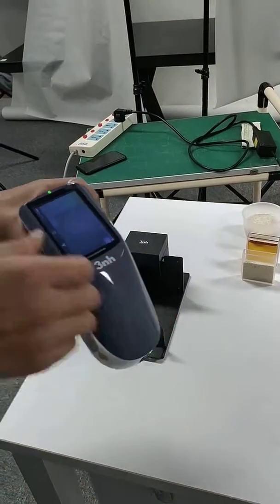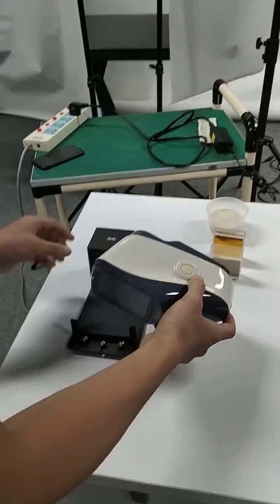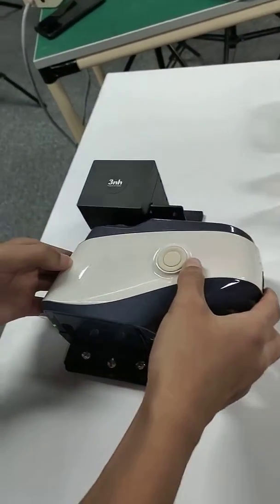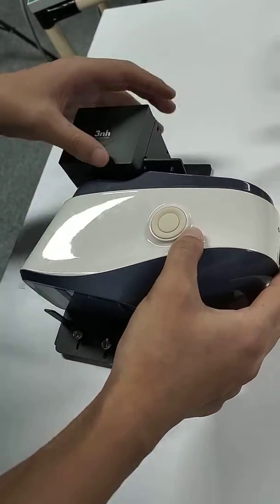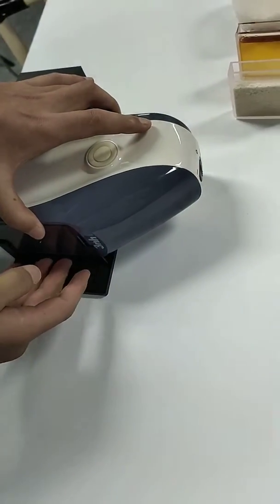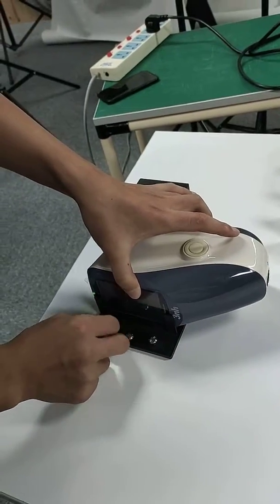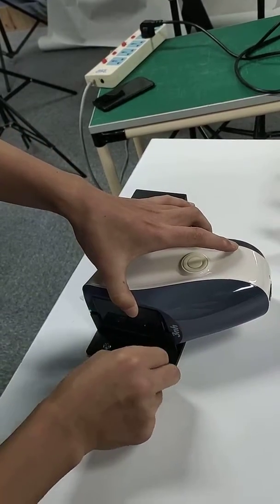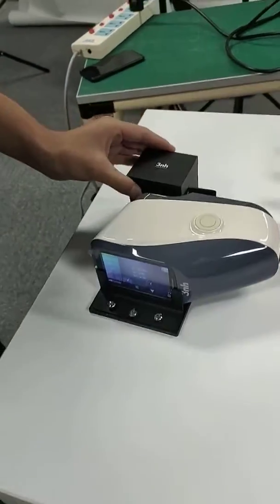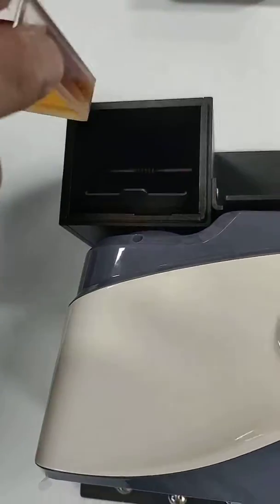After we calibrate the instrument, we install the instrument onto the universal test component like this, and then we put the samples here.